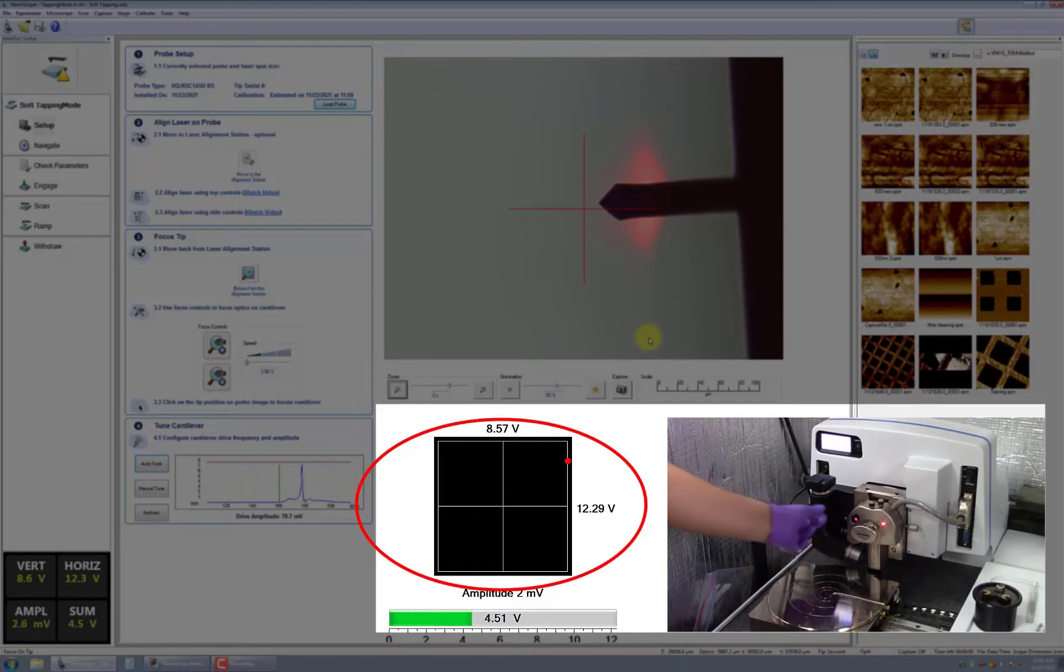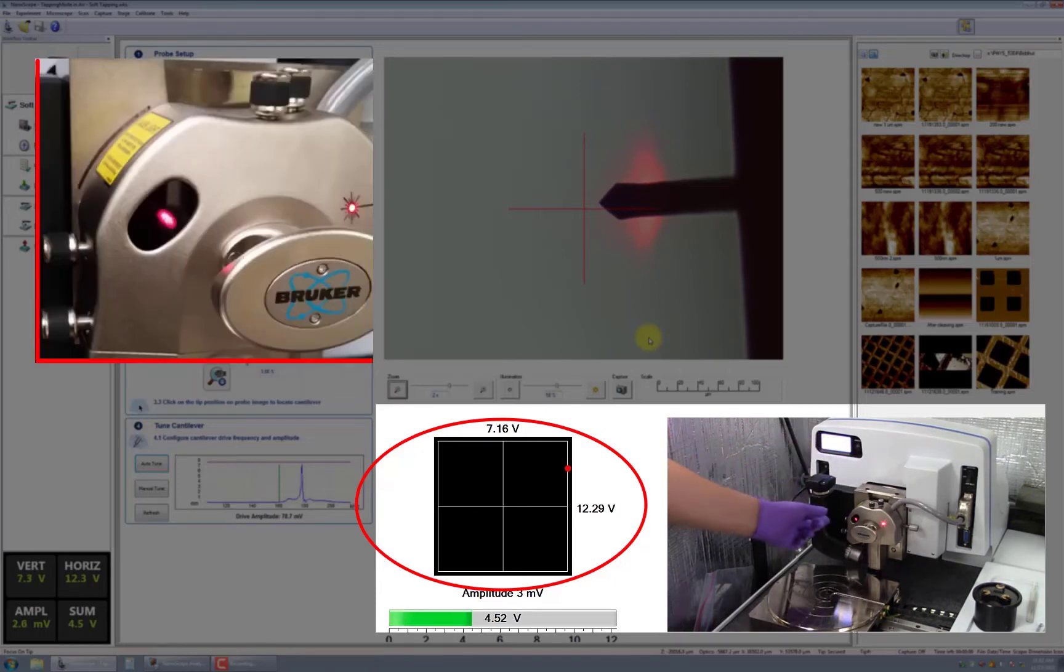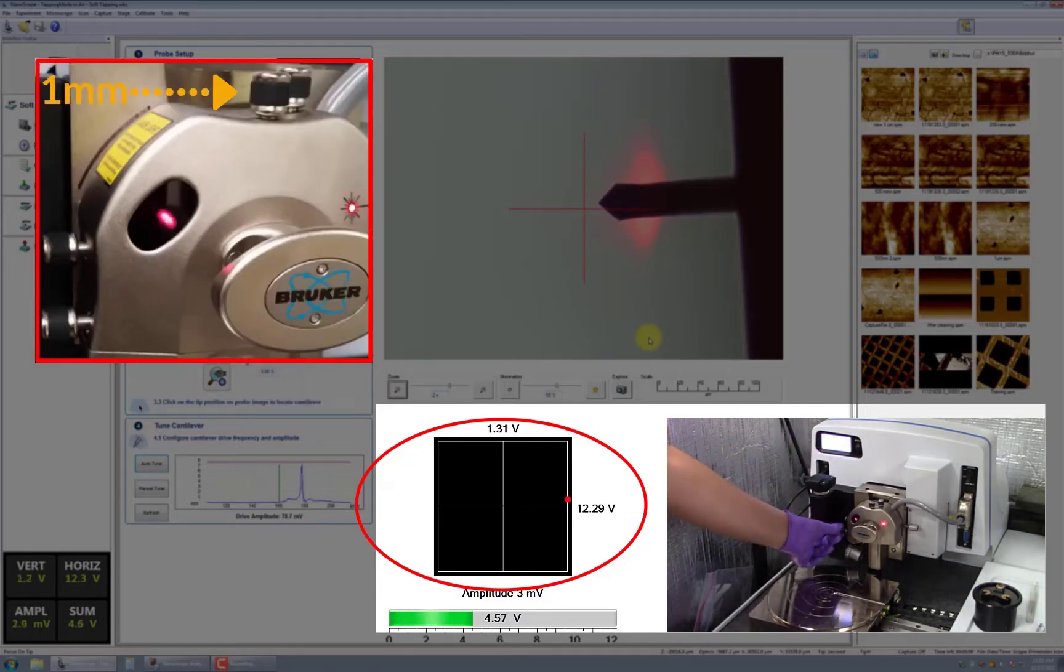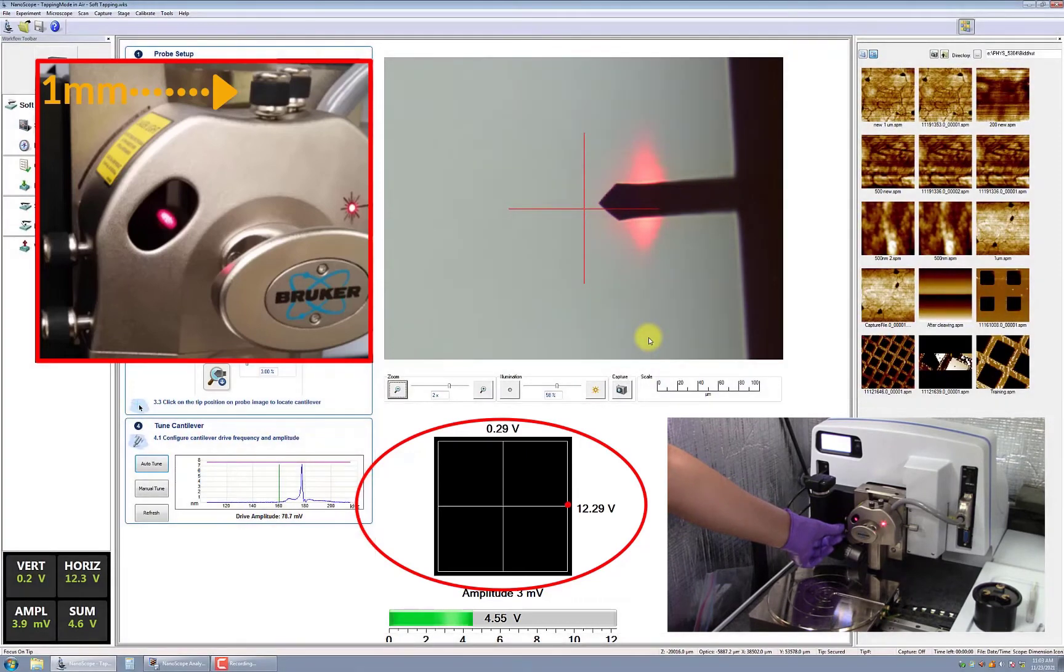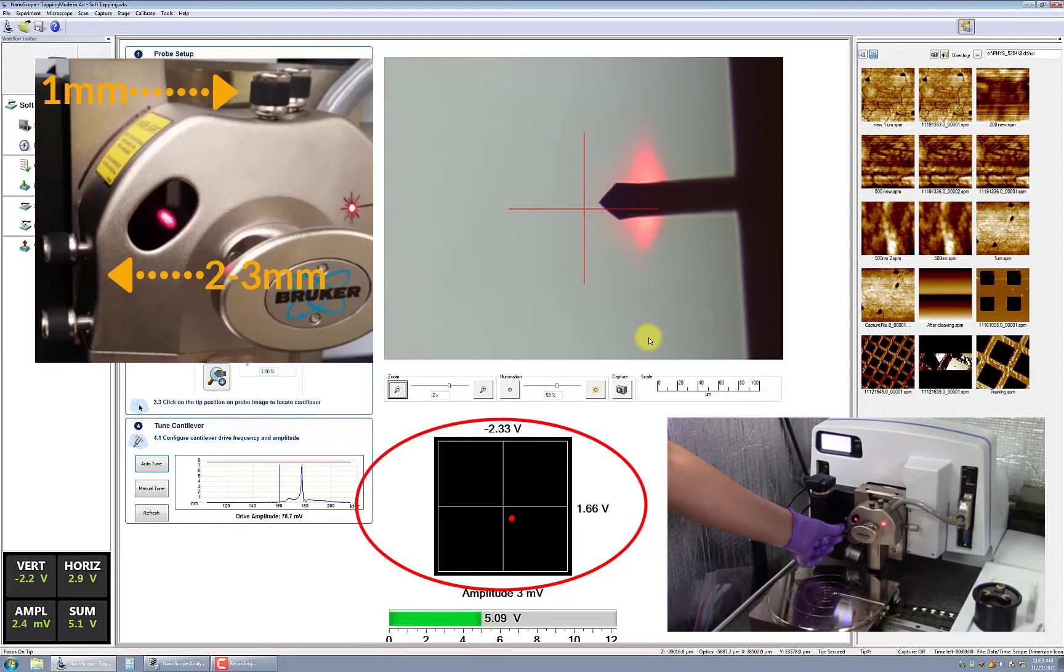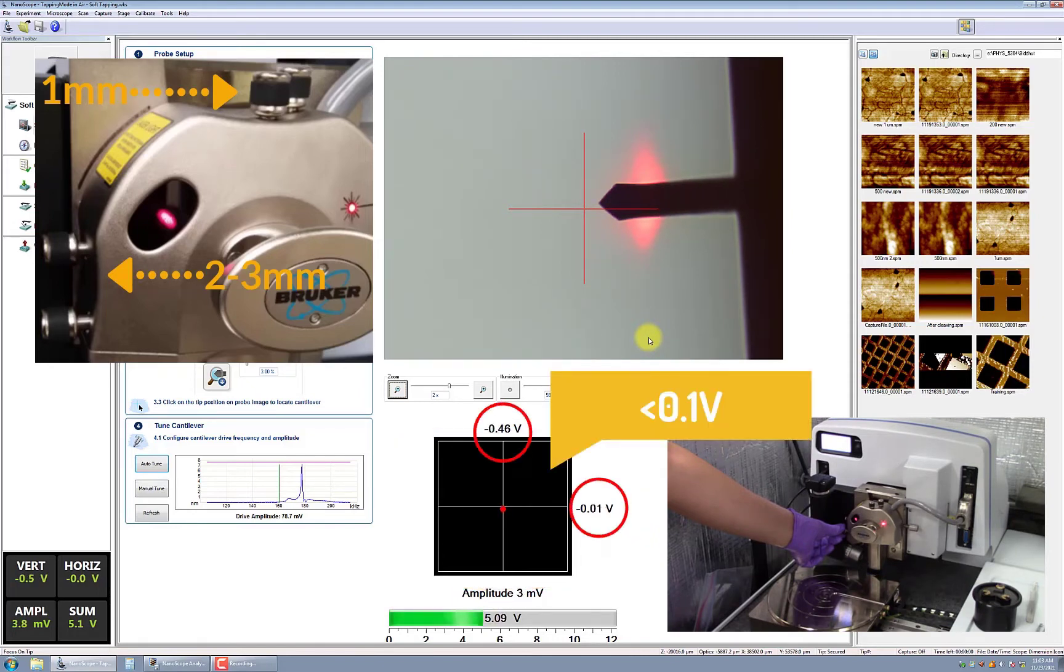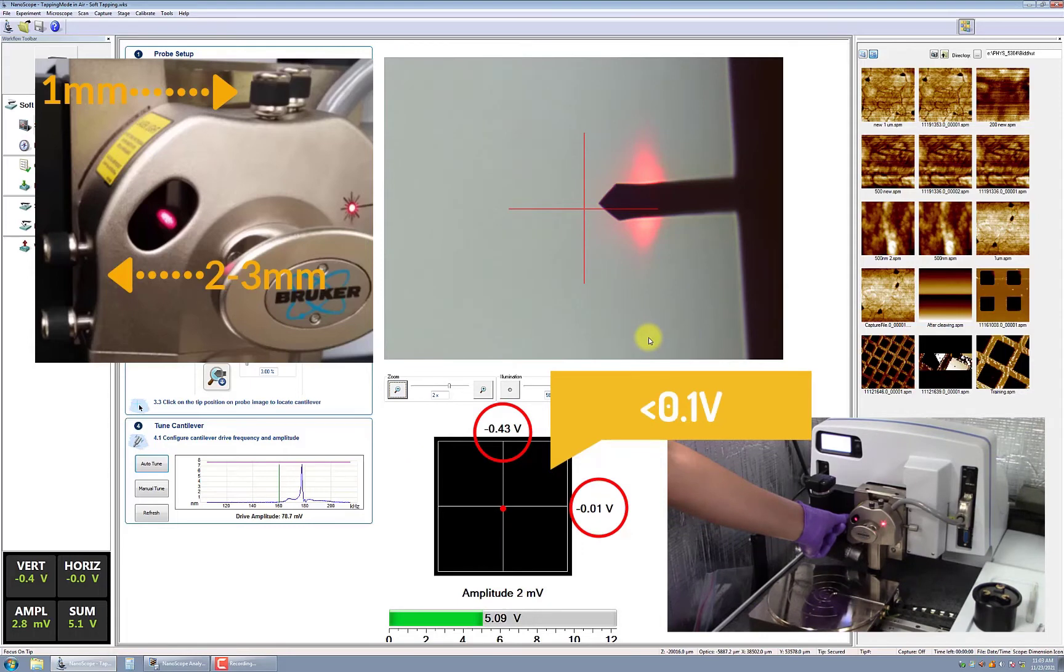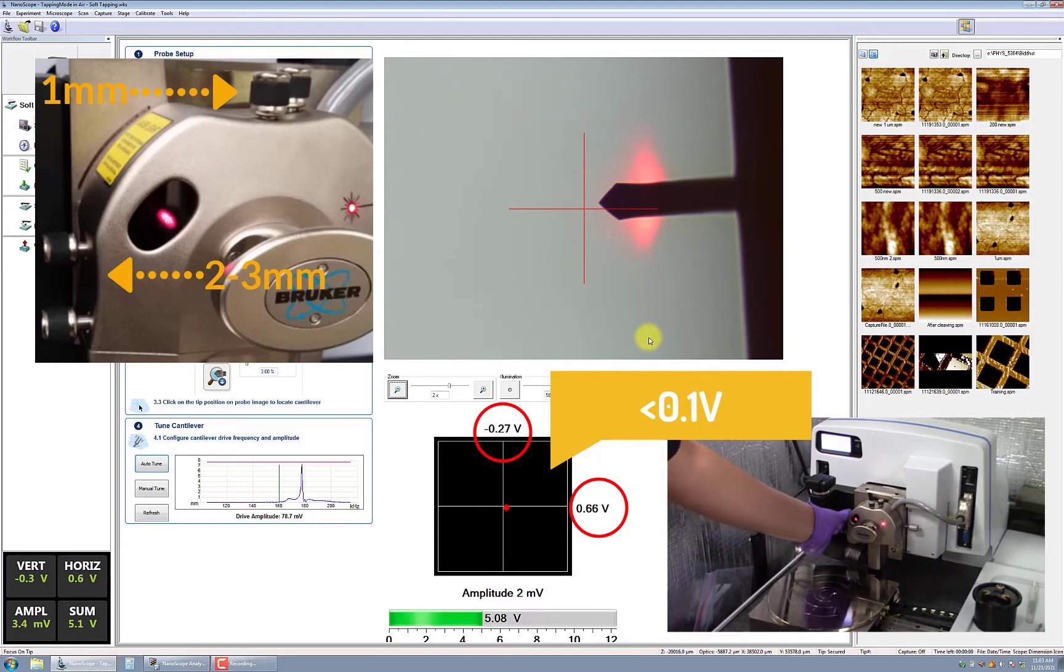A few things to keep in mind: make sure that the laser knobs should have no more than 1 millimeter of shaft showing, while the photodiode knobs should have 2 to 3 millimeters of shaft showing. If the laser knob shaft extends beyond 1 millimeter, you will not be able to see the laser. And similarly, if the photodiode shafts are not in the 2 to 3 millimeter range, you will not be able to see the cat eye in the scan head window.